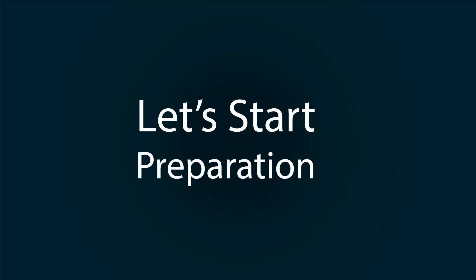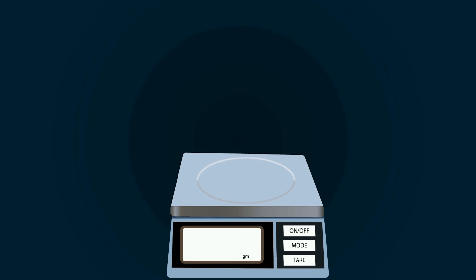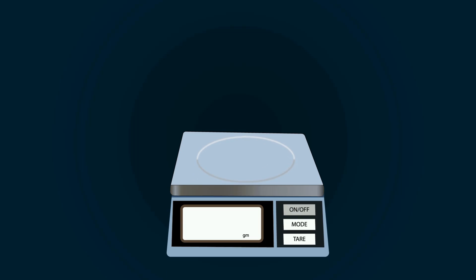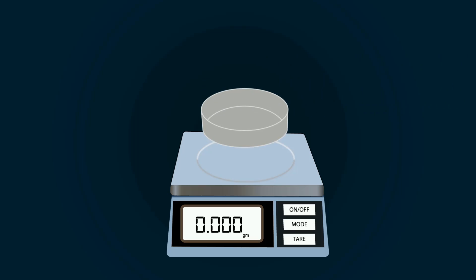Let's start our preparation. First of all take a weight balance and put petri dish on it. Don't forget to take a tare.